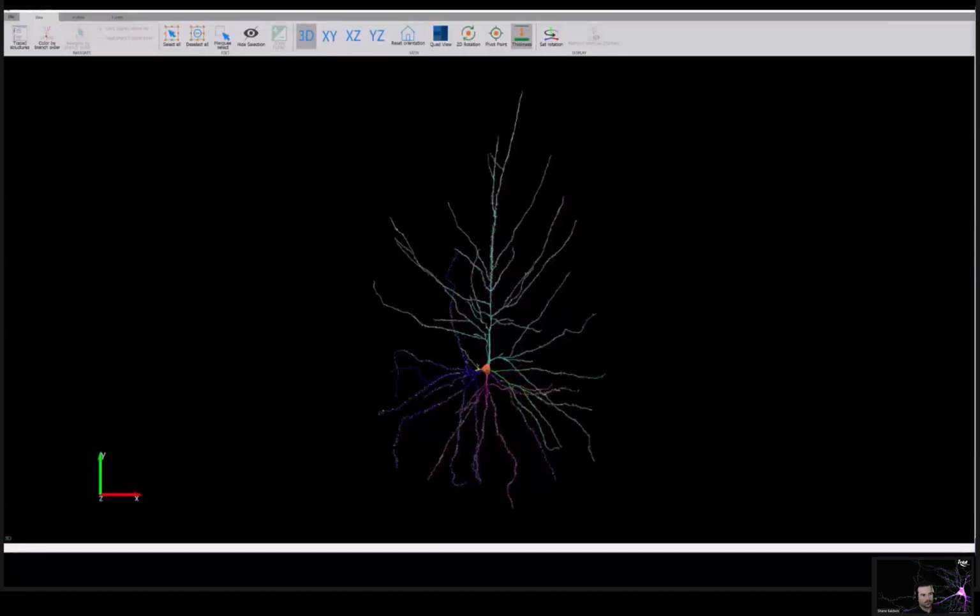And here we have our group 2 cell that we traced earlier. We want to go ahead and not only analyze this image and this tracing, but the rest of our resulting XML files from our batch pipeline. So we'll go up into the Analyze tab and select Batch Analysis.